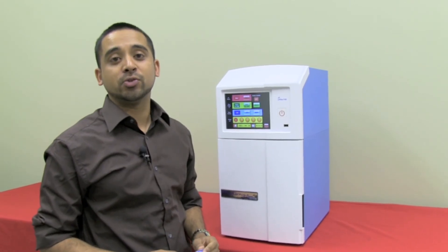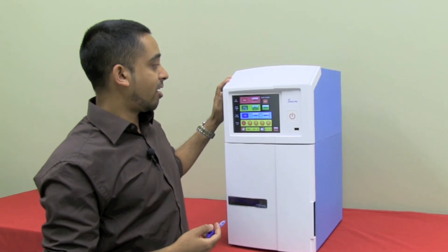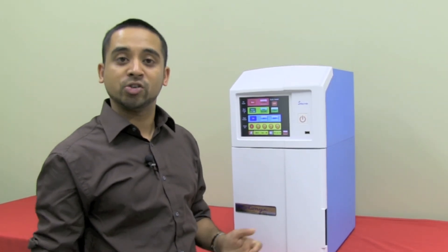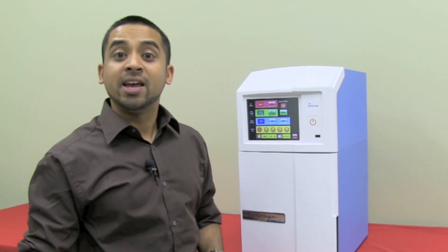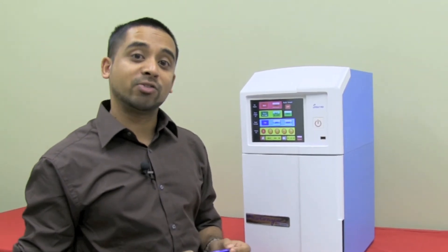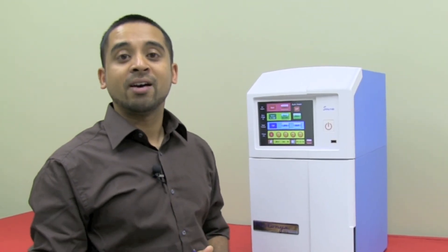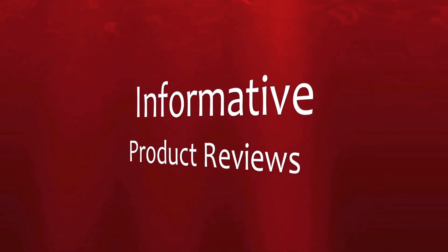In summary, the S140 is a small, easy to use, convenient gel documentation system that is probably suitable for many of your routine gel documentation applications. If you require any additional information, full specifications on this instrument are available below. Make sure you like us on Facebook, and I hope to speak to you again soon. Thank you.